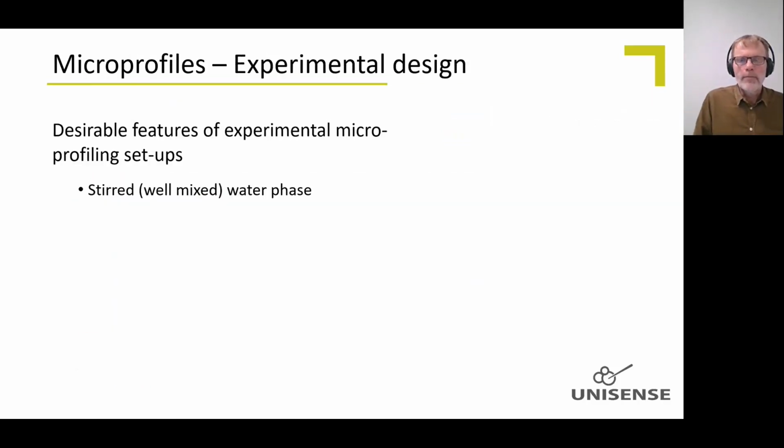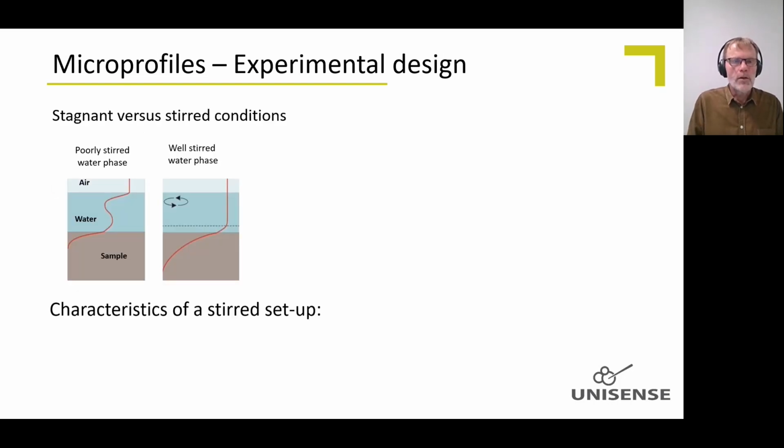So when you want to make a setup for measuring microprofiles, there are things to consider. First, we would want a stirred and well-mixed water phase. So here I show two situations. Here's a not well-mixed water phase.